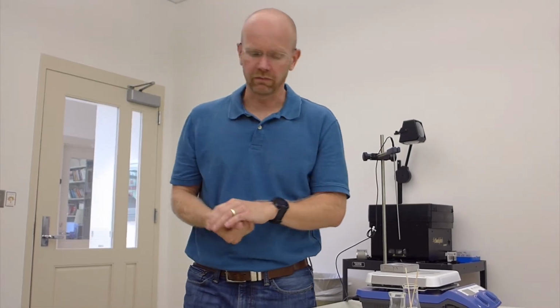And sometimes what you have to do is make a mixture. You take one solvent that it's really insoluble in at all times and one solvent that it's really soluble in at all times, and you make a mixture of those two, right, in some proportion. That is now beyond a simple recrystallization. Now you're actually having to fine-tune a solvent mixture, kind of like you do for TLC. Okay, so that's something that you can also do if you can't find a perfect solvent.